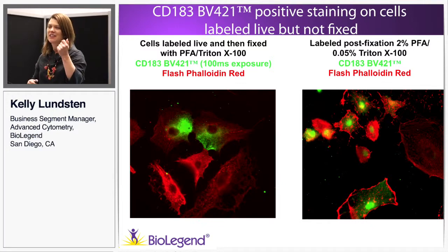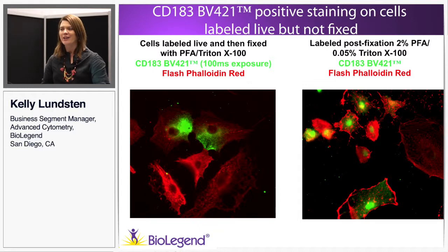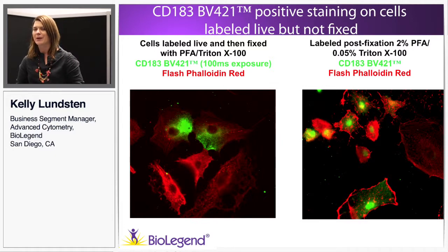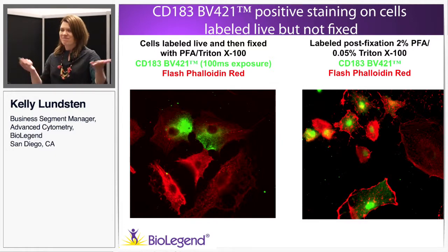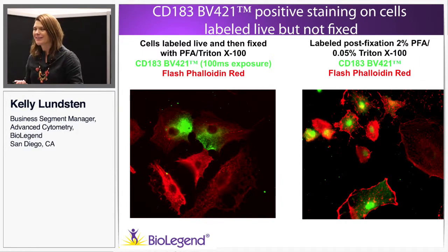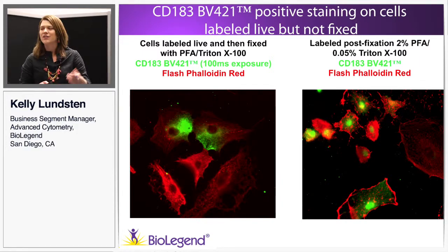straight to the nucleus. I was with Molecular Probes for 6 years. I've looked at a lot of microscopy images that y'all have sent us over the years. Any reagent that goes straight to your nucleus and is not intended to be there, that's entirely nonspecific binding. So that's the result I got. I can't use it on fixed cells. That's okay. It looked fantastic on my live cells, and it survives fixation.